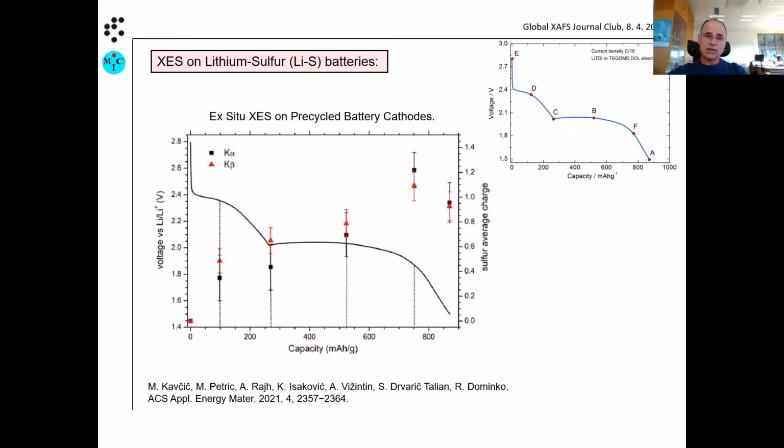There is also an example of operando in the paper, but I have not put it here because it's not so representative, though it shows a proof of principle. We see the reduction there, but it's difficult because it turns out that MeV protons are not really ideal. They are high energy particles, and in this case an X-ray tube would be much better.